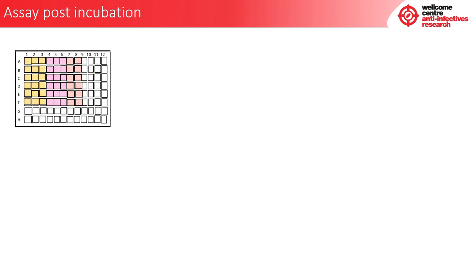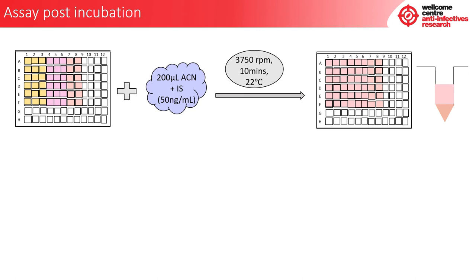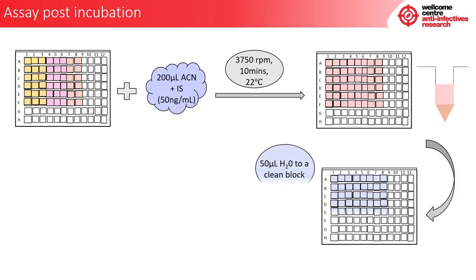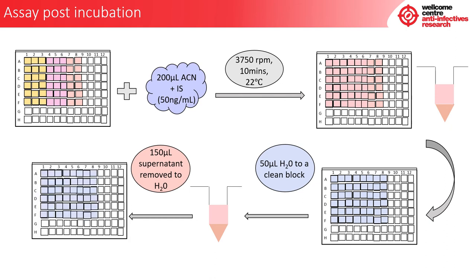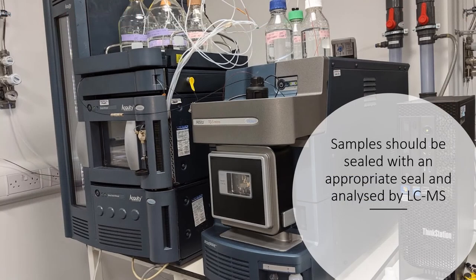Now we have our 2 ml 96-well deepwell block containing all samples. Add 200 microlitres of acetonitrile with internal standard. Next, centrifuge the block at 3,750 rpm for 10 minutes at 22 degrees Celsius to pellet any remaining fibrinogen. While the block is in the centrifuge, get a clean 96-well 2 ml deepwell block and add 50 microlitres of deionised water into the same positions as the sample block. Once the centrifuge has completed, take 150 microlitres of supernatant and transfer it into the block with the deionised water. The block can now be sealed and is ready for LC-MS analysis.